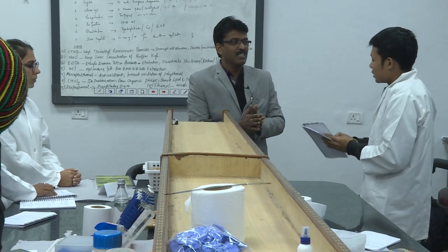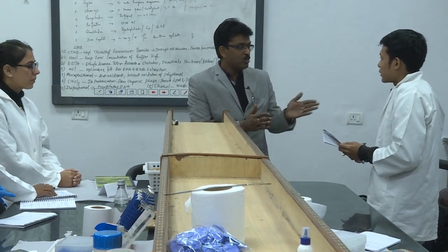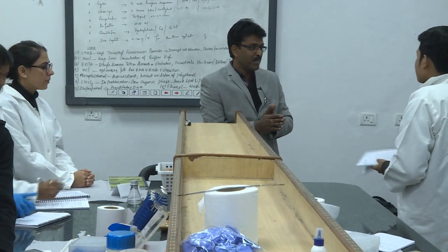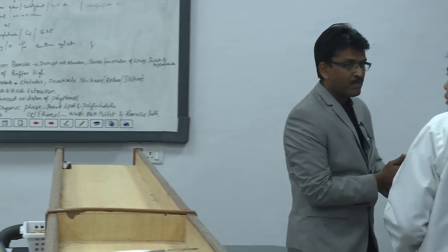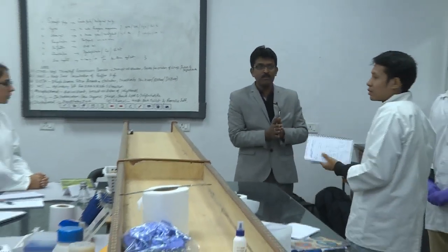We can start it now. Yes, let us start that now. So you got the protocol for amplification of ITS 1 and 4? You got the protocol. Okay, this group can start PCR now. So who are all there in your group? Call the group members.